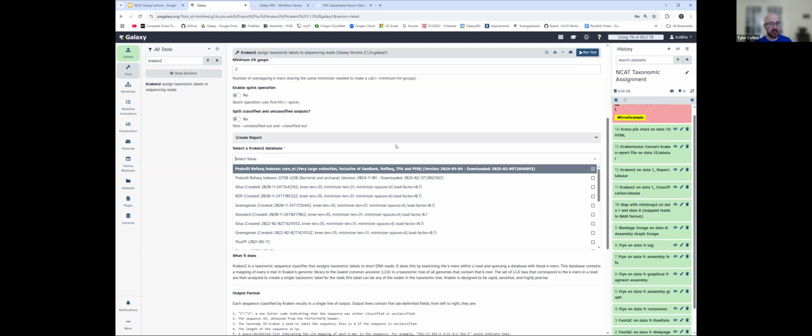These are very large, and often if Galaxy is under high load, can get you in a little bit of a wait queue. The GTDB V220, I believe, takes up 500 gigabytes of RAM on its own to run before any of your data is put in. So very often you can easily hit 800 gigs, a terabyte of RAM, which is a significant amount of computing resource. But luckily, through our great admins, especially through Nate, who helped get all this set up, we're able to run it and have people go through it. Just often, if too many people are trying to use those massive databases, it can get a bit of a queue to ensure there's enough high memory nodes available.